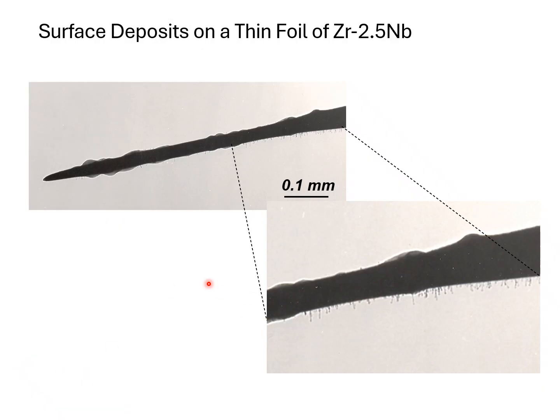A colleague of mine from many years ago, Ross Gilbert, he's the one who made me aware of this in the first place. He'd done some work back in the 70s tilting a thin foil, because with it being zirconium, there was an awareness that we shouldn't be seeing cavities. And it didn't look right because sometimes they have that wormy kind of appearance.